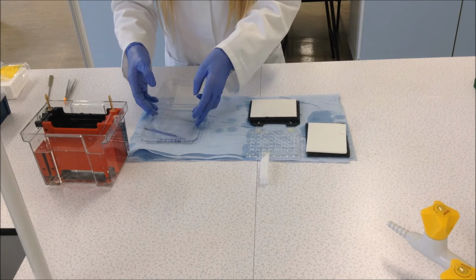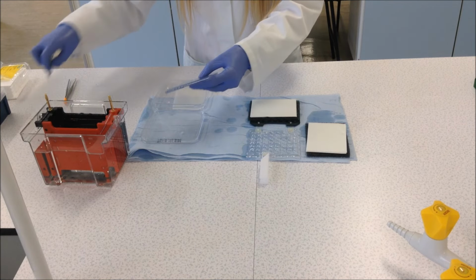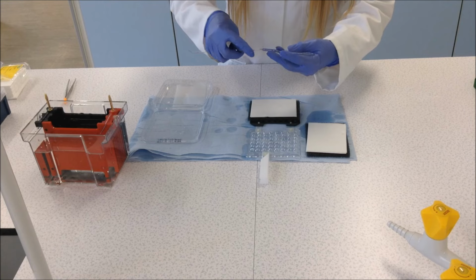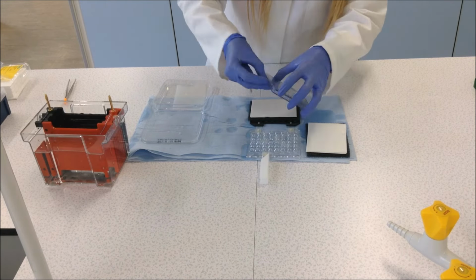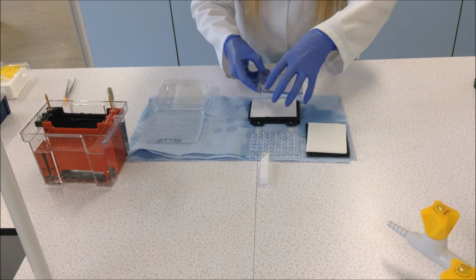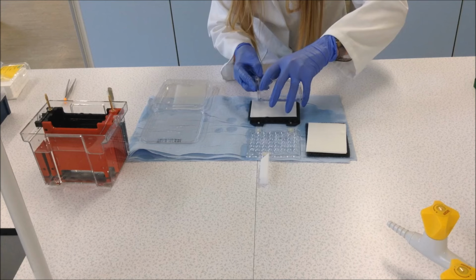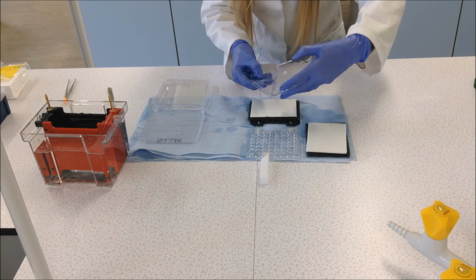The next step is to place our polyacrylamide gel on top of that. To remove the polyacrylamide from the plastic, you must carefully crack open the corners, ensuring that you do not break the polyacrylamide in the process. Once you've cracked open the plastic, you must then take care to notice where your polyacrylamide is.